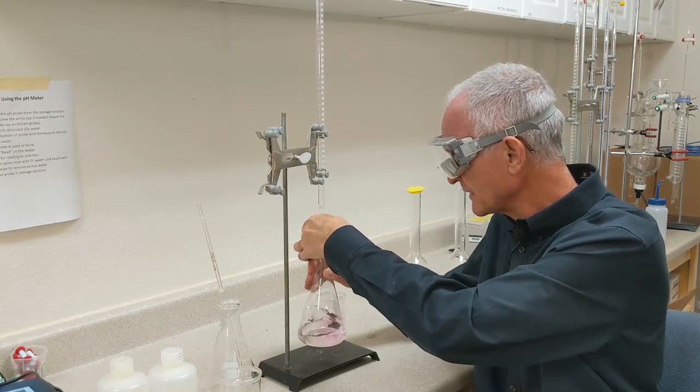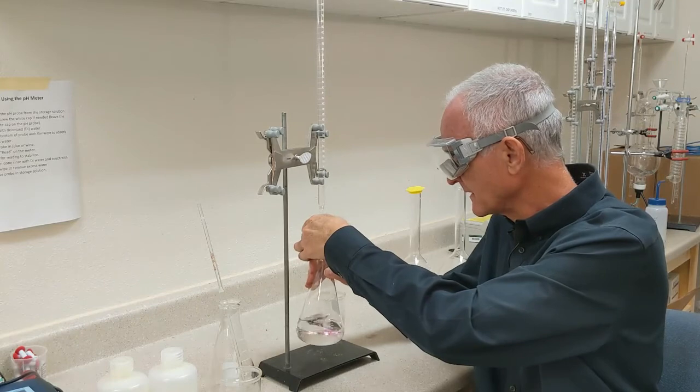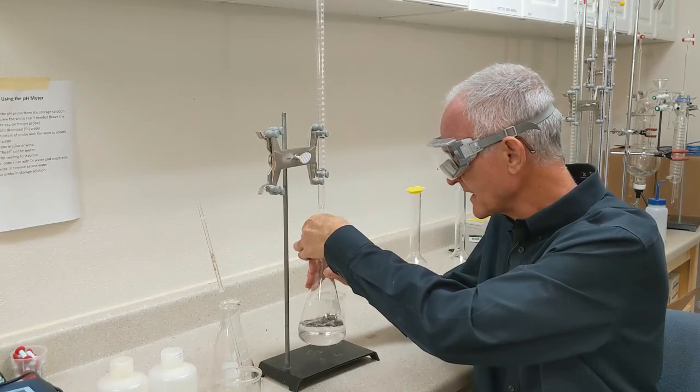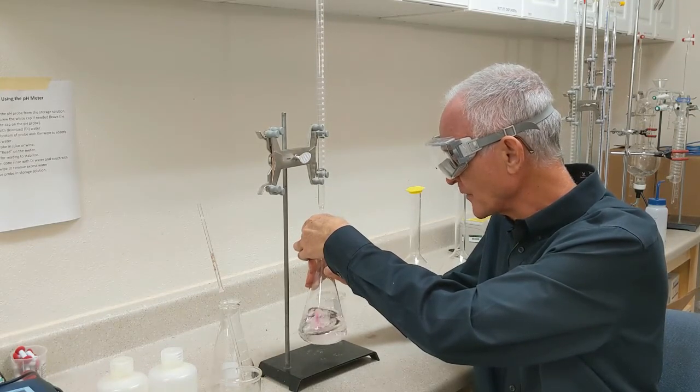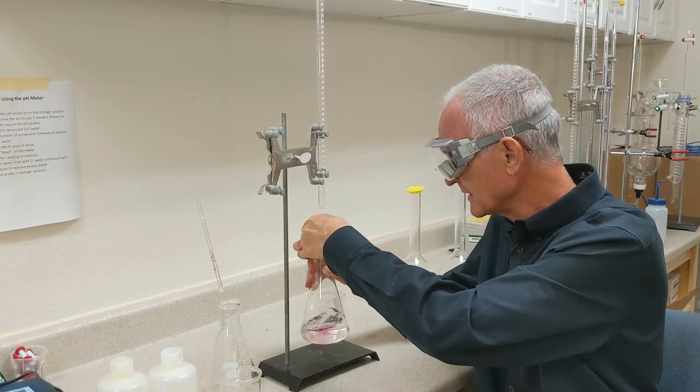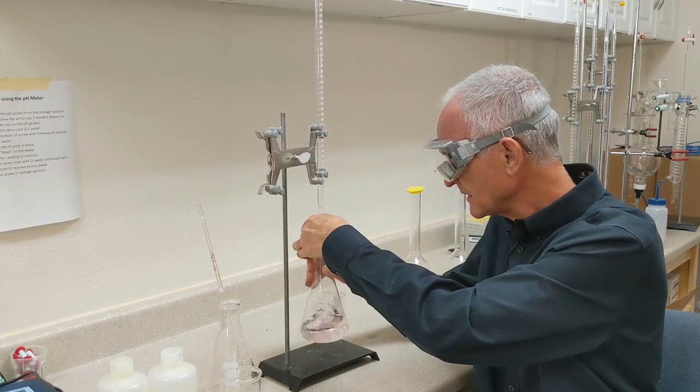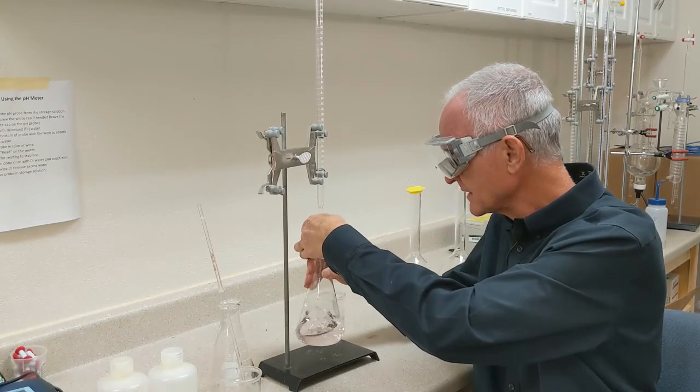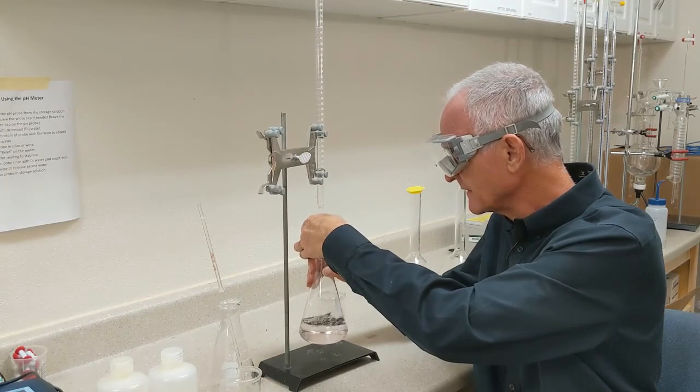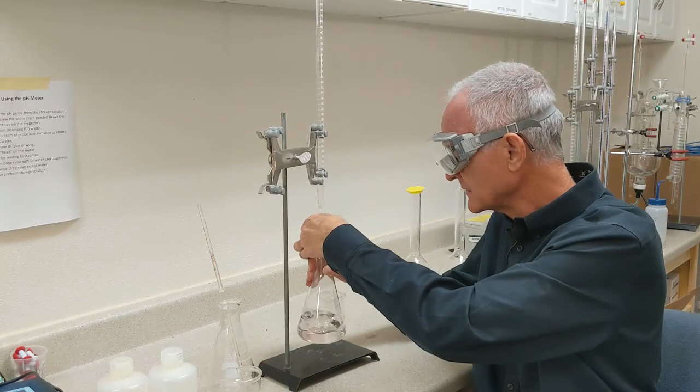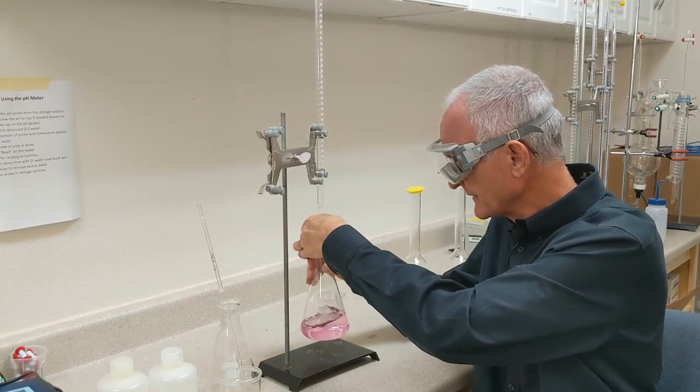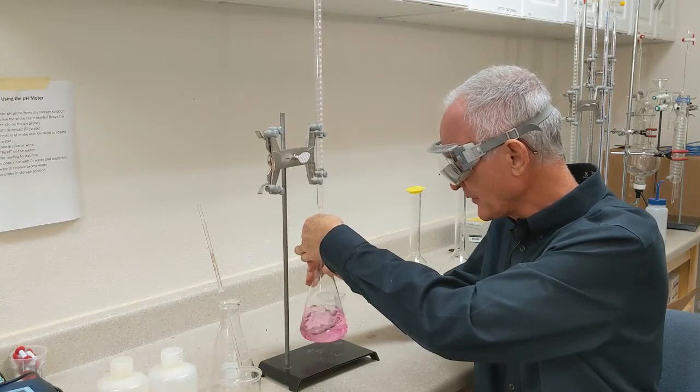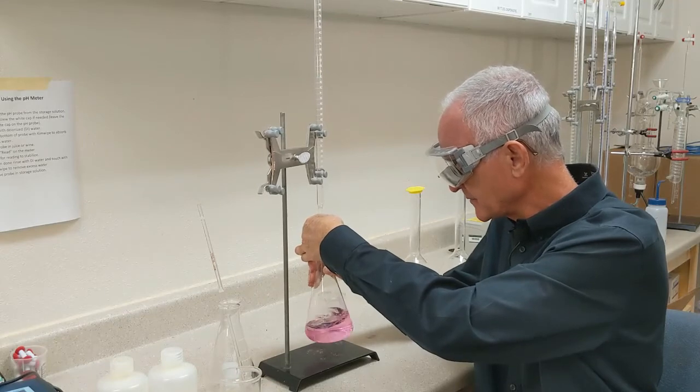I'm going to slow down the drip so that I can try and stop it right at the endpoint when I have a pale pink that persists. So you can see the pink is starting to remain a little longer. Still not quite staying for long enough. But I'm really close. And I think I'm probably there. Let's see if this persists.